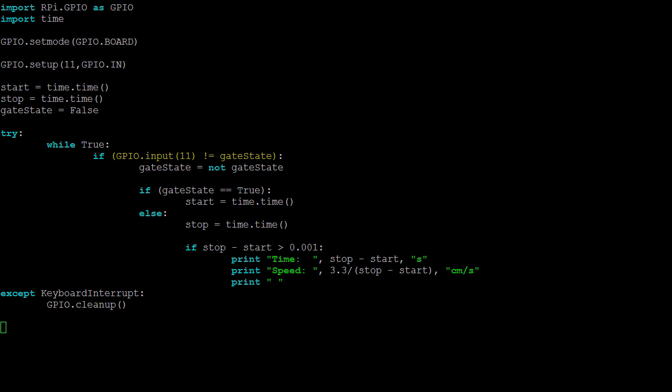When the input pin changes to true, we'll notice this change by comparing it to gate state. All of the remaining code is placed in a try-except block to safely allow for keyboard interrupts. Unless interrupted, the program will continually loop through one important question: Has the value of the GPIO pin changed from its last known value? If it has, either something has entered the gate or something has left it. The first thing to do is flip gate state to the new value.